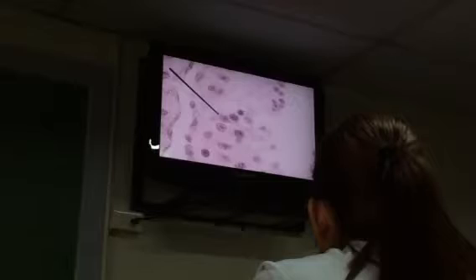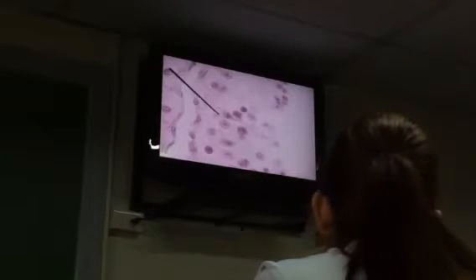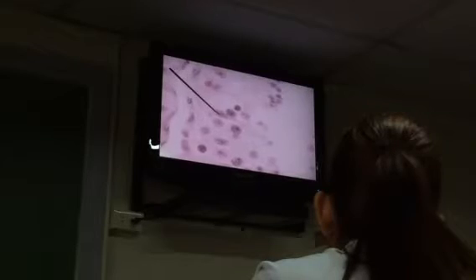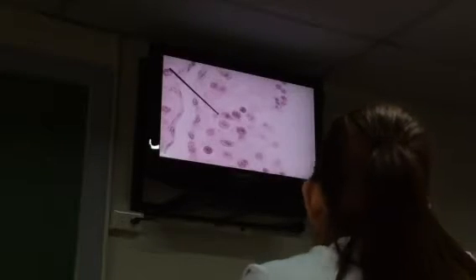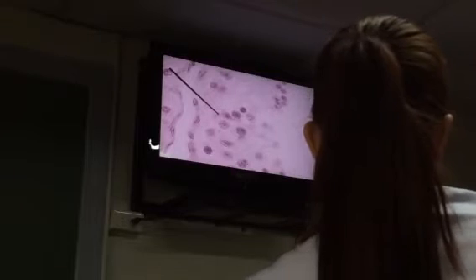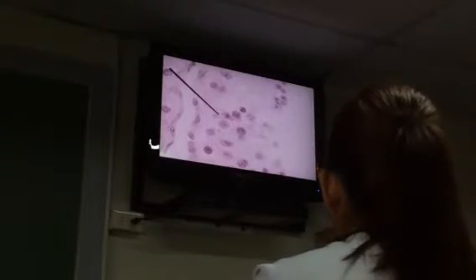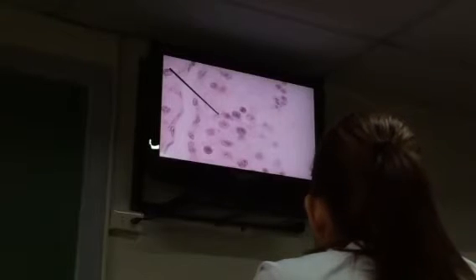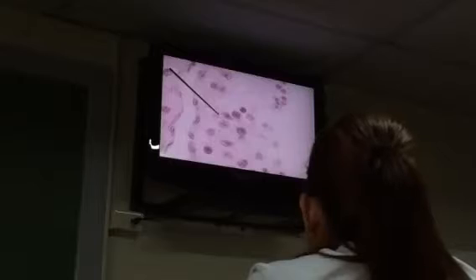Ito pa. Tama, galing ni sir, oh. He was able to see this. Very nice. So that's another one. Look at that. Okay? So those are your Sertoli cells. It's really not that difficult. Just look at the nucleus. That is your clue that you are looking at a Sertoli cell. Okay, those are the things I'd like you to identify, most especially the Sertoli, because we have not identified that before.